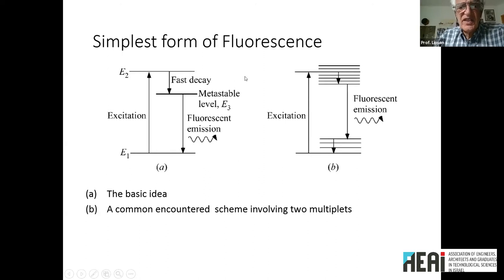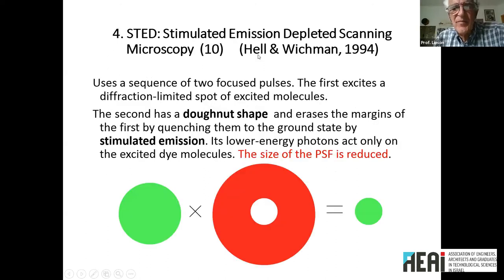And the STED system by Stefan Hell, invented in 1994, gets a super resolution factor of 10 using what is called stimulated emission depletion scanning microscopy, STED.